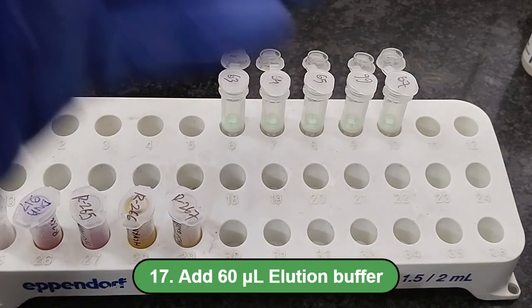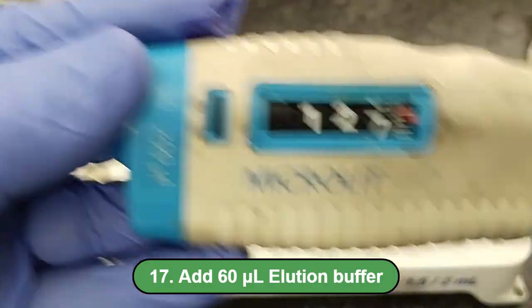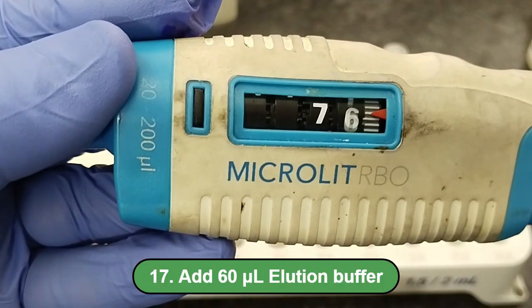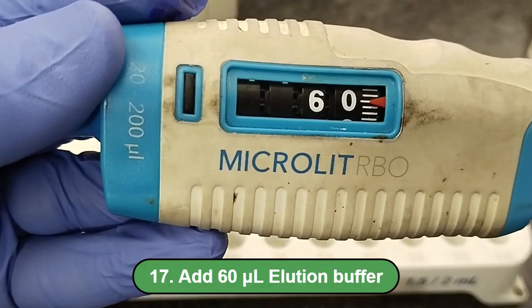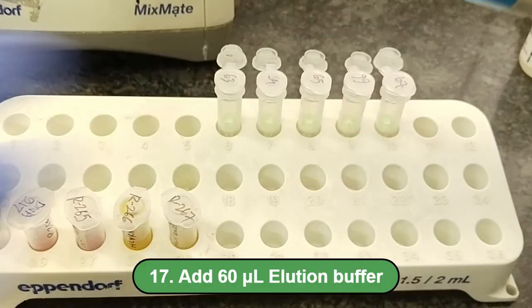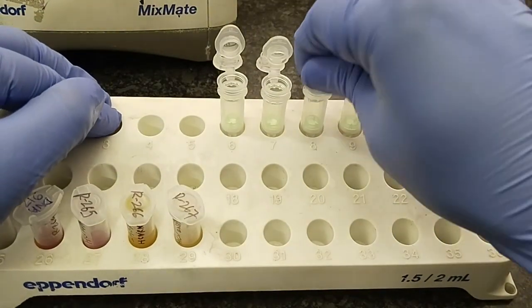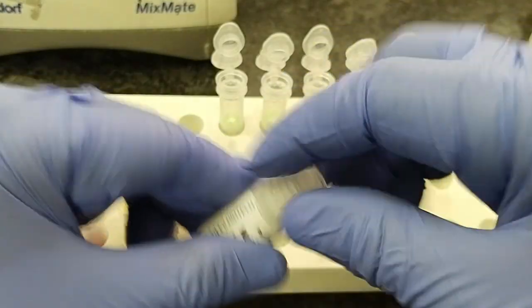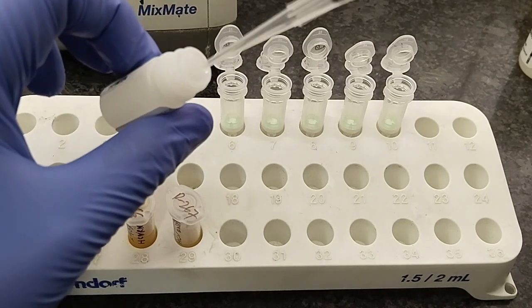So add 60 microliter of elution buffer into the column. Add 60 microliter nuclease-free water. Open the lid, then add nuclease-free water to the column.